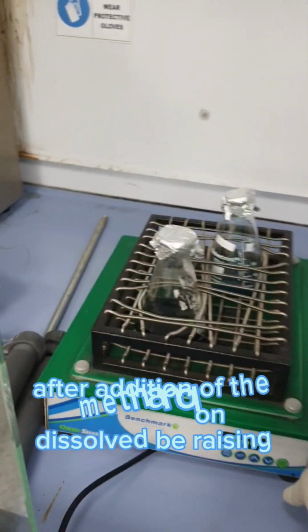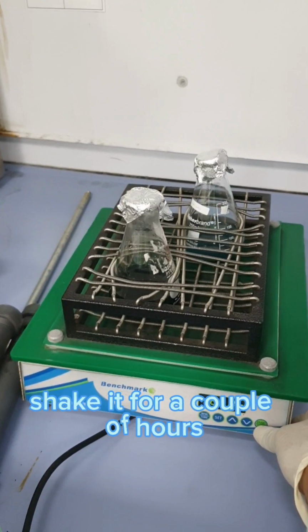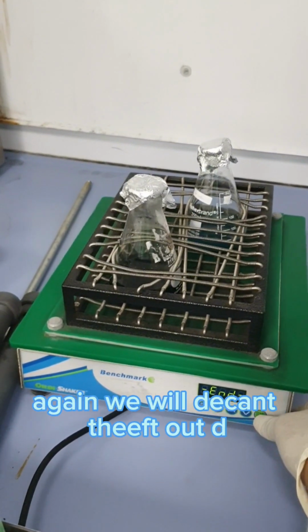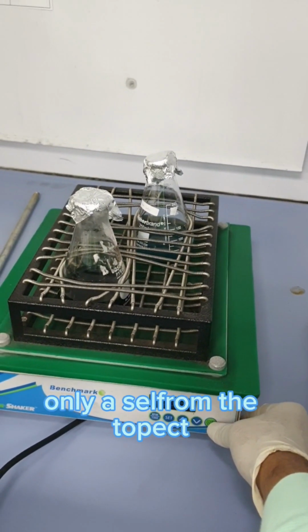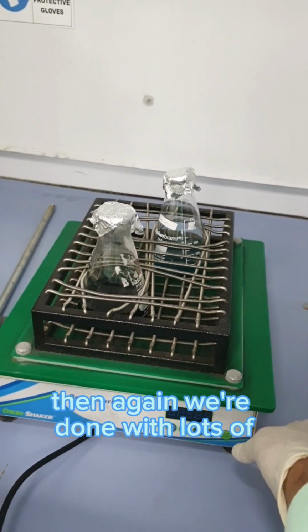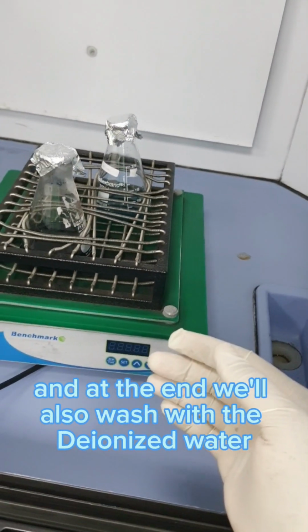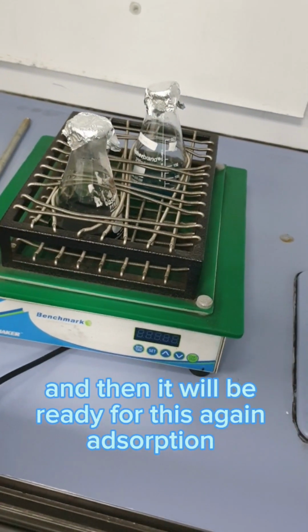After addition of the methanol, the desorbing agent, we will shake it for a couple of hours, 1 or 2 hours. Again we will decant the liquid from the top, leaving the solid. Then again we would add methanol. We will continue this process 2-3 times, and at the end we will also wash with deionized water, and then we will dry it, and then it will be ready for the second adsorption.